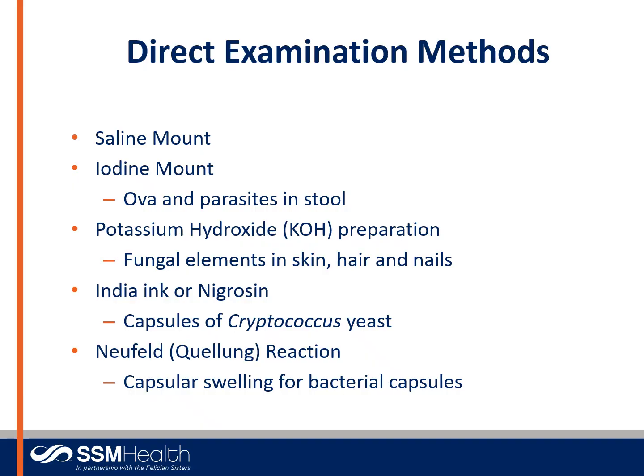There are different direct examination methods, but honestly, we don't use too many of these anymore in a microbiology lab. But they are listed here. We'll go through some of them.